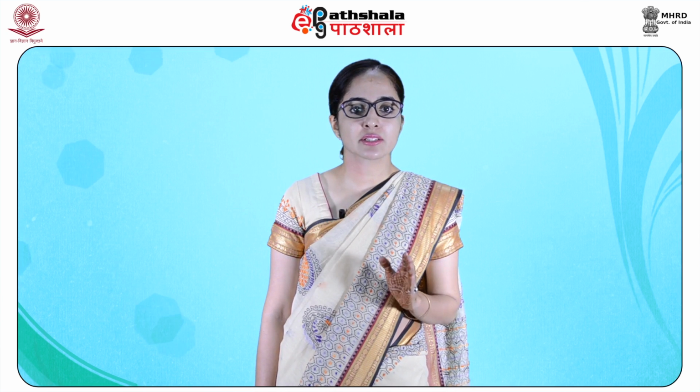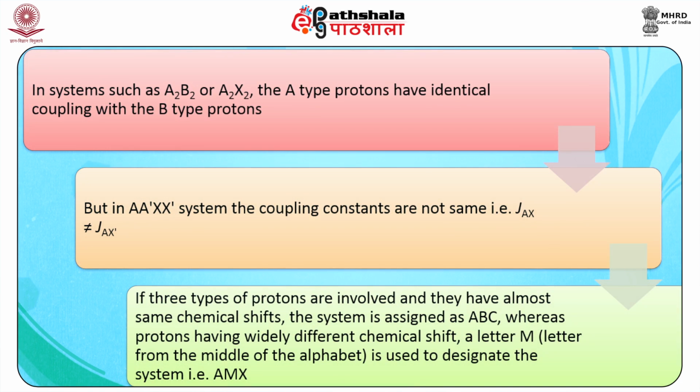If protons have the same chemical shift but are not magnetically equivalent, they are labeled as the AA' system. Thus, in systems such as A2B2, A2X2, the A type protons have identical coupling with the B type protons. But in the case of AA', XX', the coupling constants are not the same, that is JAX is not equal to JAX'.